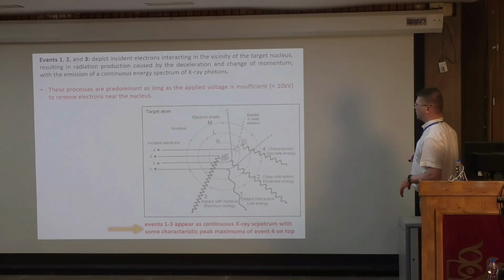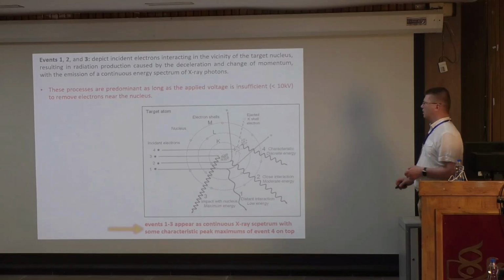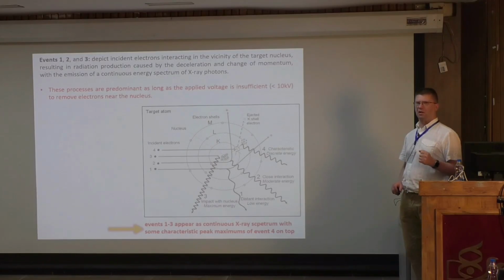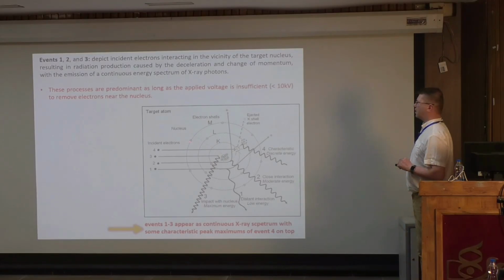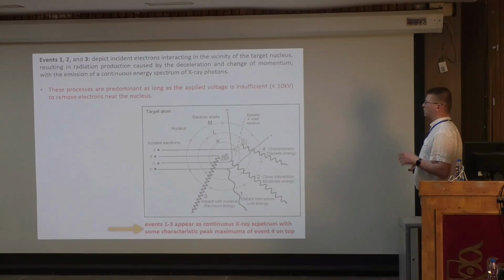And now depending on if we kick it hard or harder, we can kick it also from K to M or K to L. And when it returns from L to K or M to K, it will create a different kind of X-rays. And that's the idea. Regardless of the element, typically we use a tungsten electrode, a cathode, where we take the electrons and speed them up with a high electric field to hit the target anode, which is this thing.